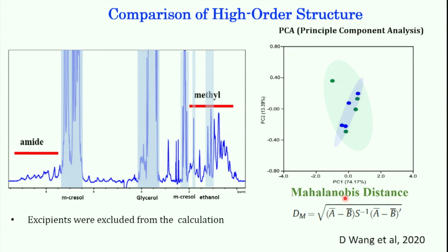The other thing one can do, even going deeper into statistical analysis, one can do the principal component analysis by taking three or more reference products, three or more of the drug product, and look at the variation by removing the excipients peak, taking the well resolved peaks coming from the peptide, and here you can see the separation is quite good. Already we are achieving 90% separation between the RLD and IHDP, and principal component analysis says that these two products are very nice.